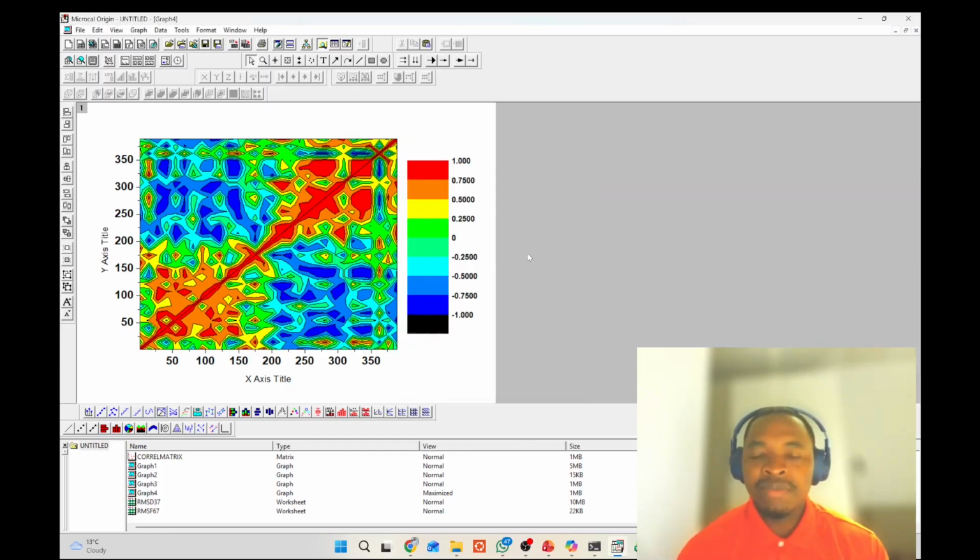So for here too, you can make it whatever you want, 20, make it bold, and then make it beautiful. After that, you can save it. These are very, very high resolution pixel images. They don't degrade, they are very great.